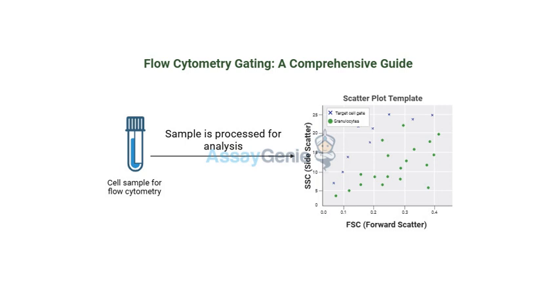And speaking of forensics, remember we talked about fluorescent spillover before? Yeah. Well, we have a really important process for dealing with that. Compensation. Right, compensation. That's where we adjust for the overlapping signals from the dyes. Yeah, like you're adjusting the volume on different instruments to hear each one clearly. Exactly. So fluorescent spillover can create false positives, right? Making it seem like a cell has a bunch of proteins when it really only has one. Right. It's like those shadows that can distort things. So compensation is how we adjust for that spillover so we can really see the true fluorescence. Exactly. It's like calibrating our instruments, fine-tuning them.